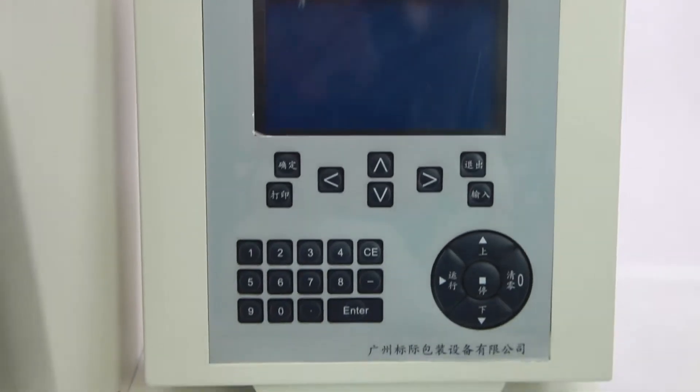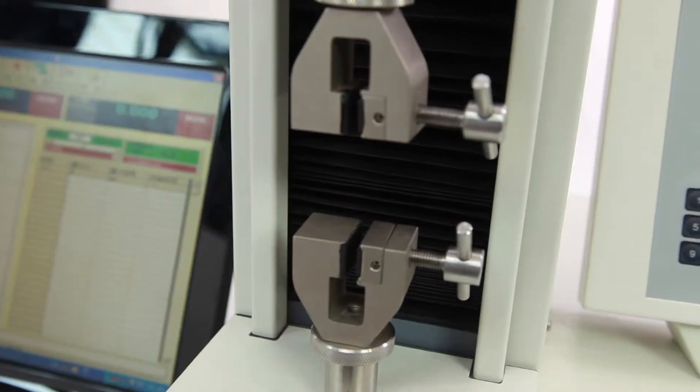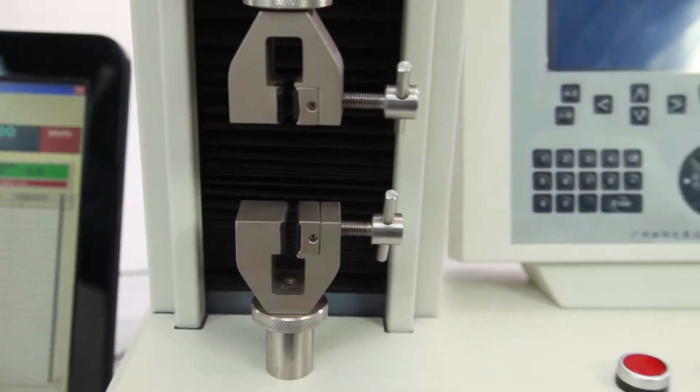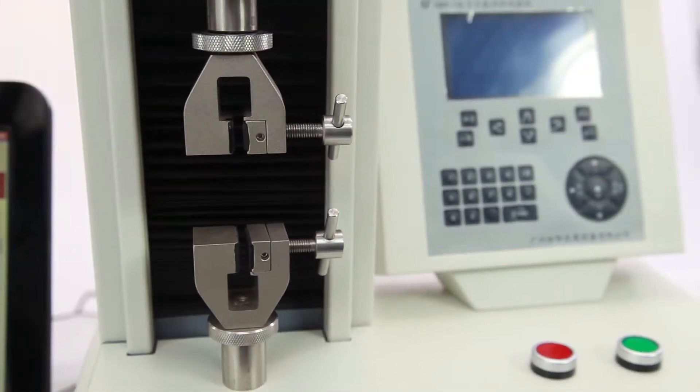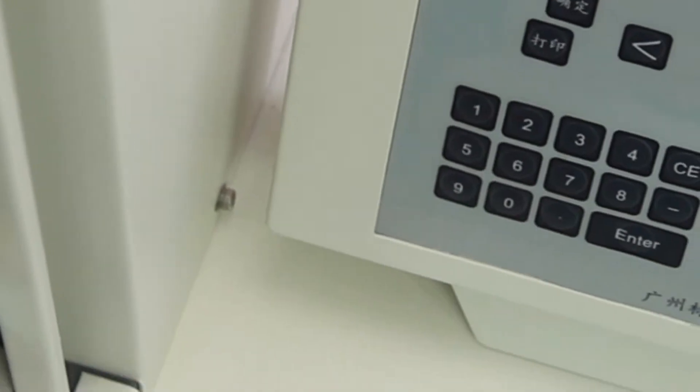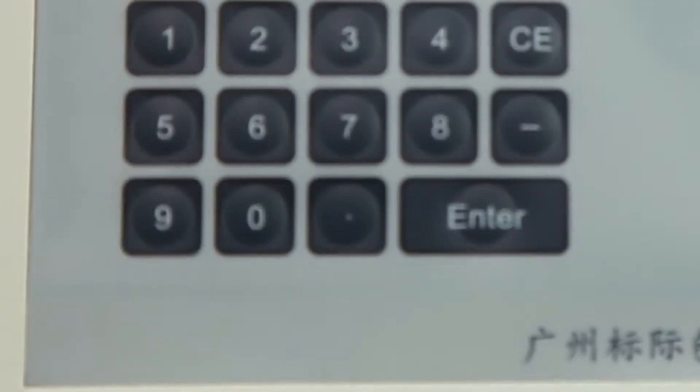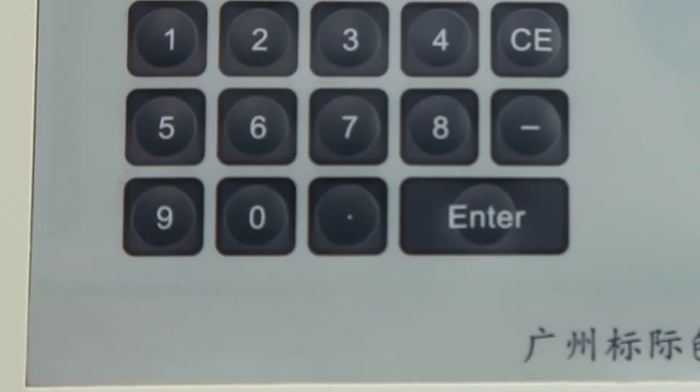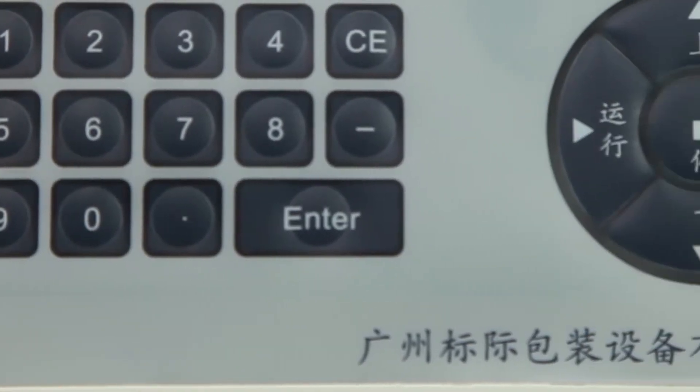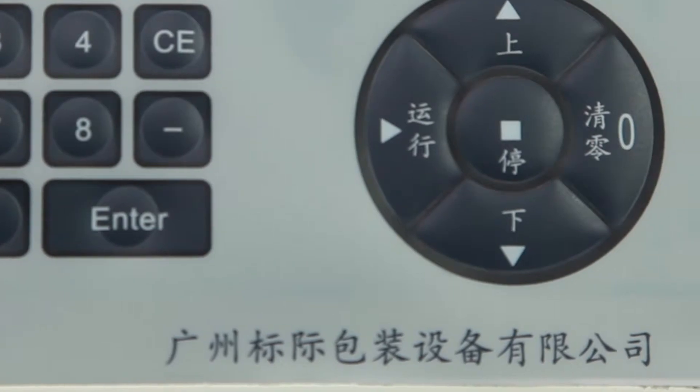GBH-1 Electronic Tensile Tester is used to test detraction, stripping, sealing, tear, piercing, and compression.